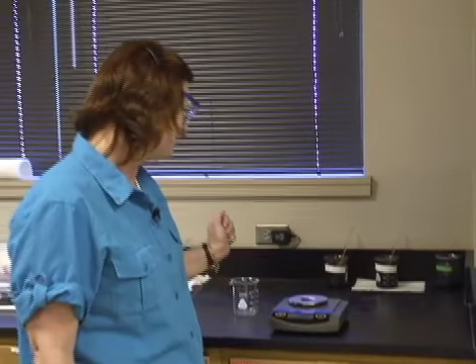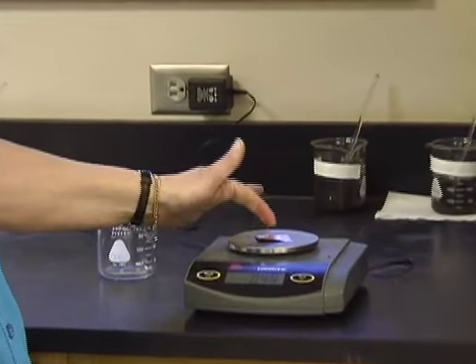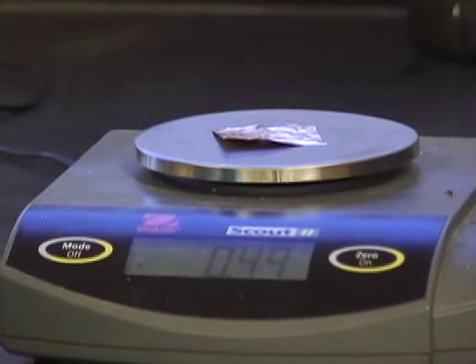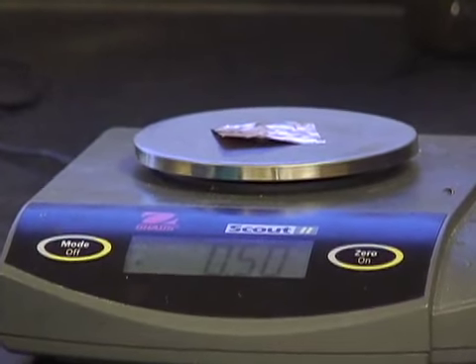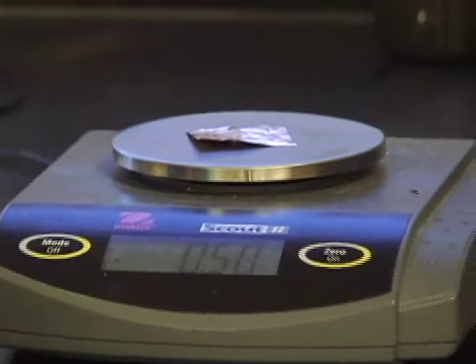I have prepared this, so it should be exactly 0.50. There we go, 0.50 grams of the copper.